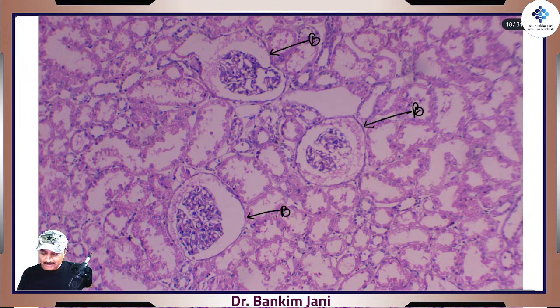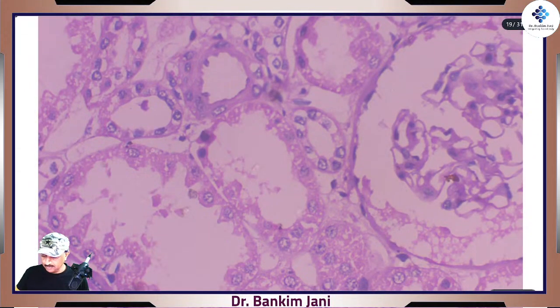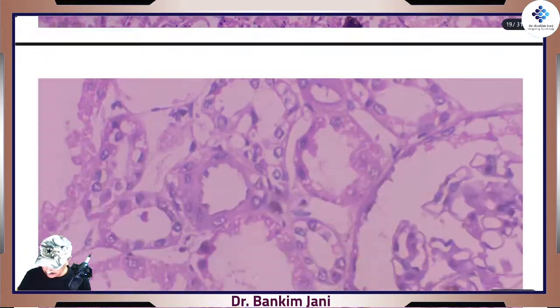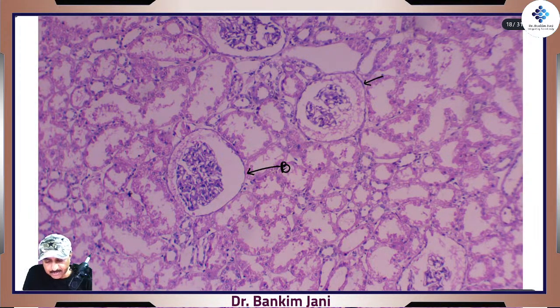Now, even at this stage, just by looking at it, it shouldn't be very difficult to find that this outer lining is pretty thin, and there are some black dashes, black nuclei. Let's zoom it further. See this one. We have picked up literally which area? Yes, we have taken this area.